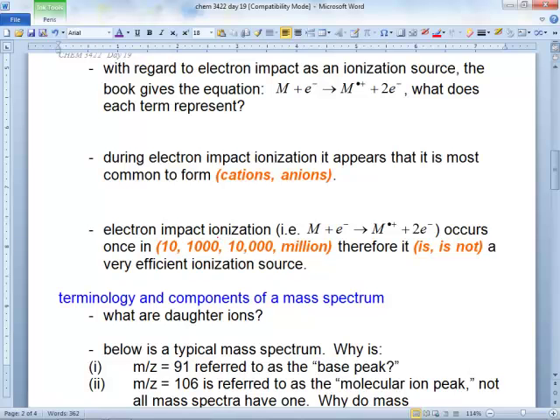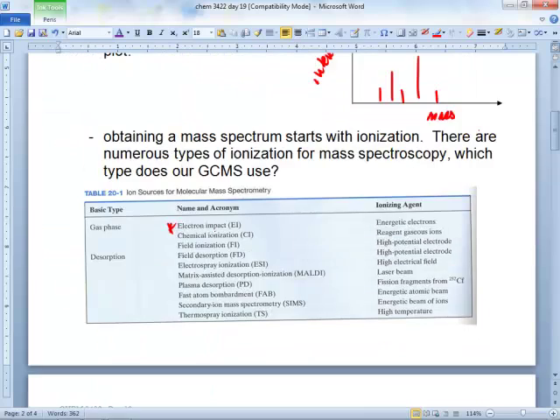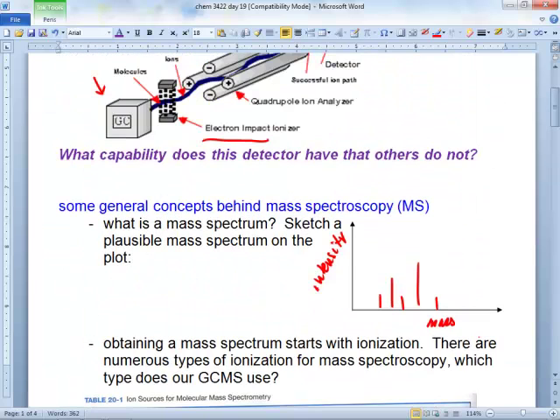And the electron, you can go back up to that little flow diagram there. It has to get slammed by an electron. Where's the electron coming from? One of these little guys.